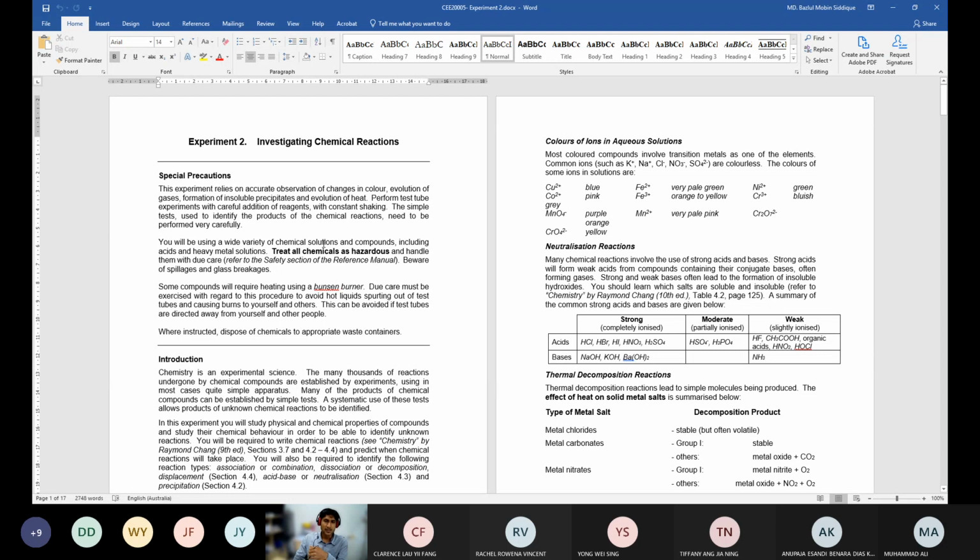You can tell us what could be the risk associated with conducting this lab, since there are so many chemicals that we had handled, right? So many chemicals we had handled here, and there were strong acid, strong base, carcinogenic chemicals, and metal oxides, and so many things. So I don't ask you to categorize each and every one, but be smart to point out those that are very prominent, like strong acid or base, or the very hazardous and carcinogenic chemicals that we gave you, or the gas that came out, or the fire, all those things.